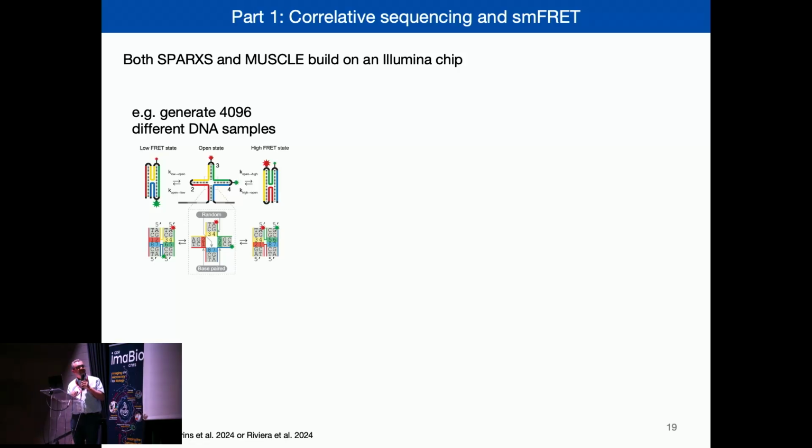So the way they designed their experiment is the following. They generate a long piece of single-stranded DNA that would form, in this case, a Holliday junction-like structure attached to fluorophores, and this Holliday junction will either assume this state or that state. This is transient, it never exists really, but it helps us to understand a little bit the sequence diversity. They made these strands mostly complementary, and then they kept 8 positions down here where they incorporated, through DNA synthesis, random nucleotides.